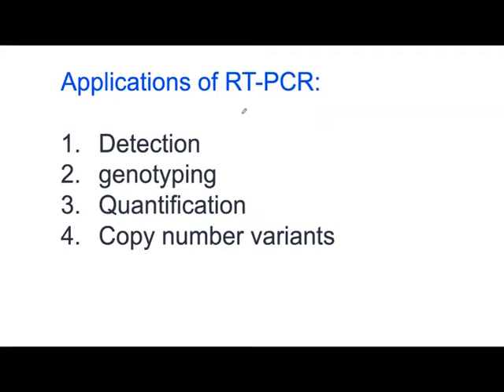I told you about what PCR is. We said PCR is a method where you need 2 primers, and you can amplify a specific region in your DNA. And then we discussed real-time PCR. That is basically a PCR, but you get the data in real time.